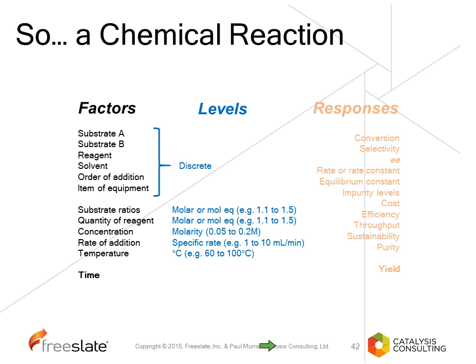If you carry out two experiments under very different conditions, the workup required to get the maximum yield from those may well be different. An example being if you run a reaction in hexane and DMSO, the isolation procedure required will be very different. And you're going to likely add experimental error to your results based on having to do slightly different workups for both of these reactions.